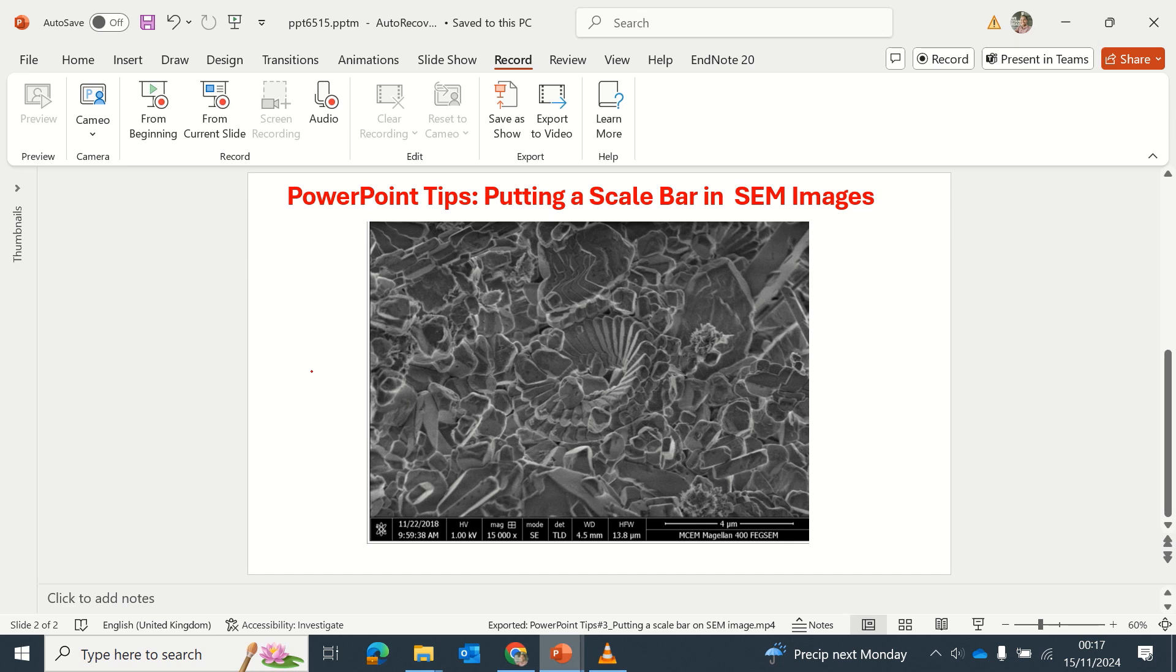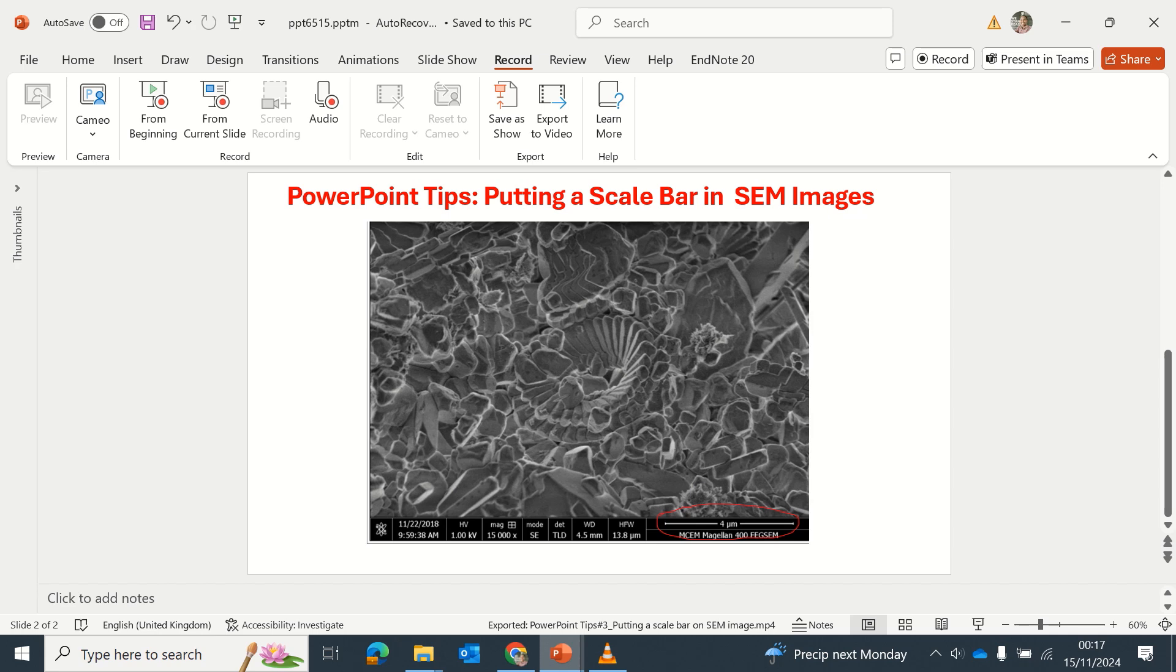Hello, welcome to today's tip on PowerPoint. In this case, I want to show you how to put a scale bar on your SEM images when you are processing your data for a report or an article.